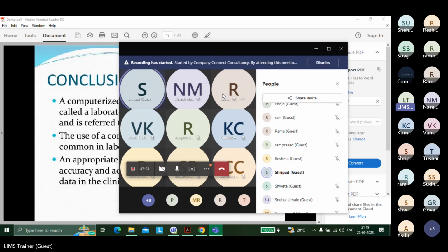Like I said, how do we assign functions, and where do we assign them? We go to the users table and assign those functions. I'll show you with a screenshot: you go to this user table, you click here, you assign this function, approve sample, then only you will be able to approve samples. If I remove this function, you won't be able to. So this is how you will know from the backend, and you'll get the confidence, that this is why I'm able to approve this.